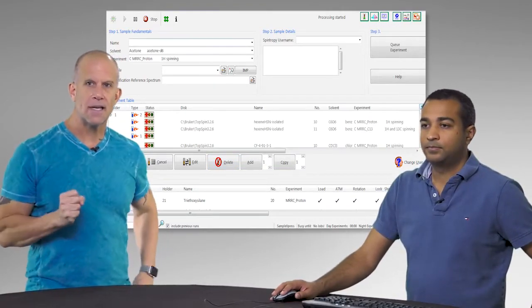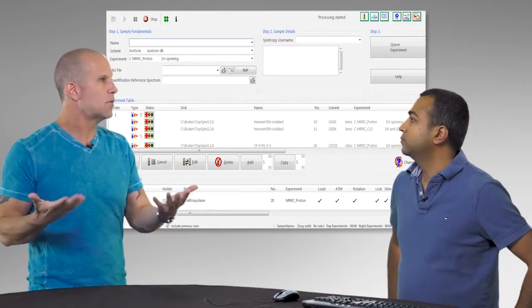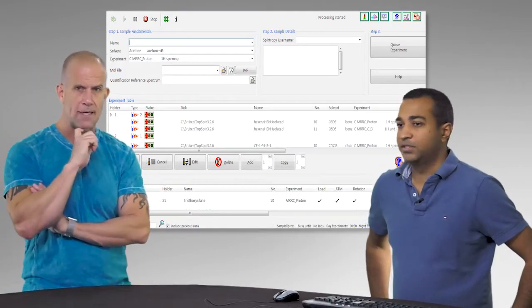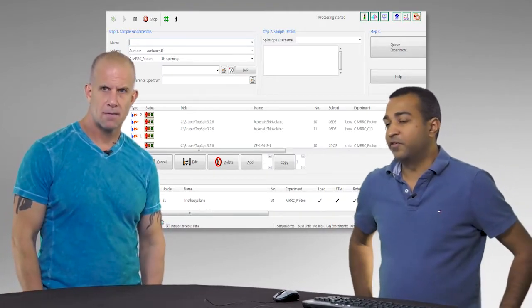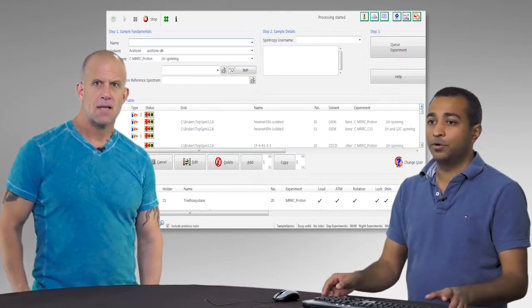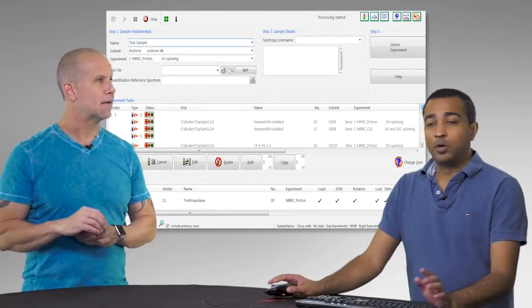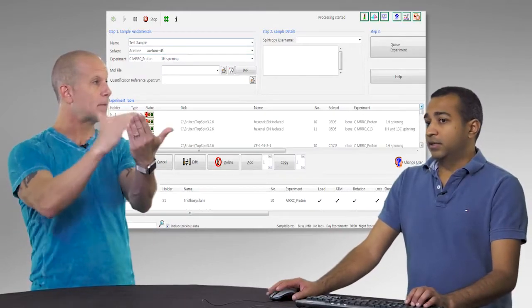You come in, you sit at the NMR. You brought a sample in with you, but before you do anything about putting the sample on the NMR, you really sit in front of the IconNMR here and enter some information. Exactly. Like you said, you only need three basic pieces of information, and then you link that to your username for data upload. You need the name, the solvent, the experiment. On the left-hand side, it can be any name, whatever you're running. And this is going to be the file name or the directory name that it gives the subset of files.